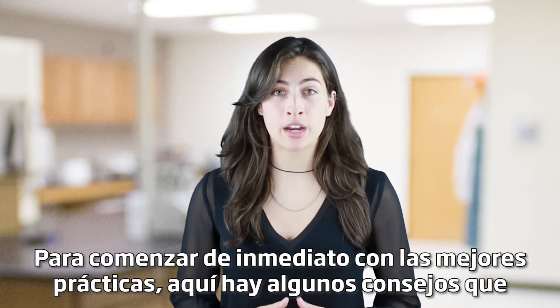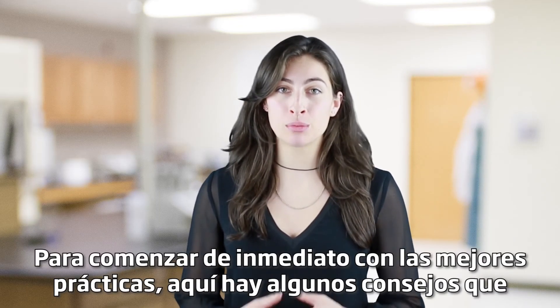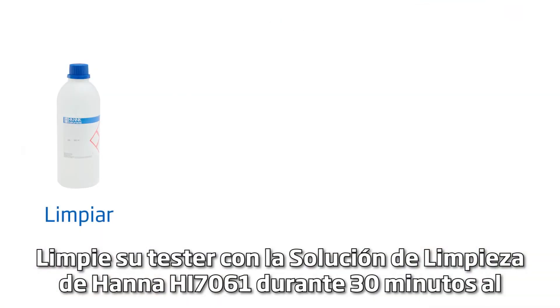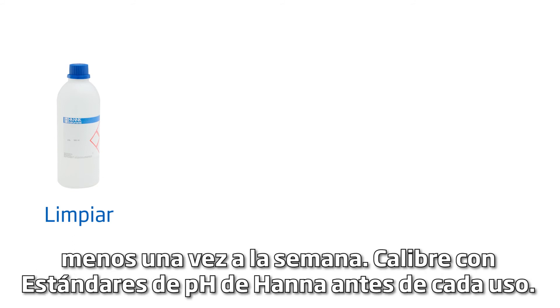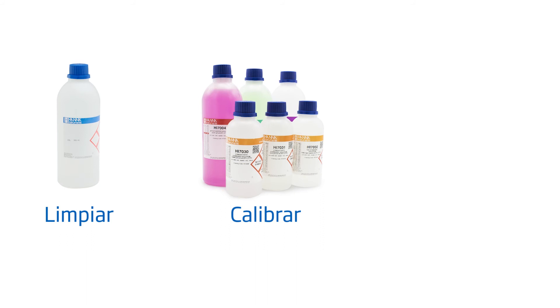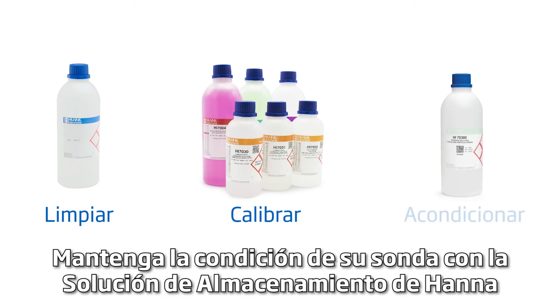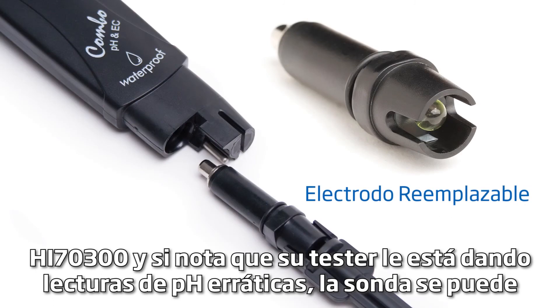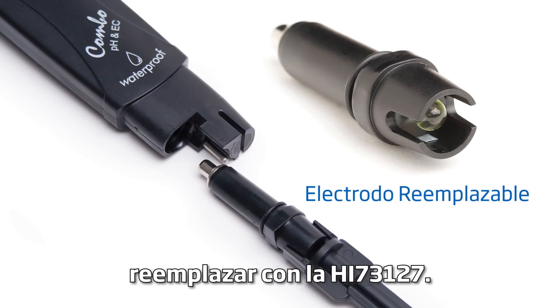To get you started right away with best practices, here are some tips for the best results. Clean your tester with the HANA HI7061 cleaning solution for 30 minutes at least once a week. Calibrate with HANA pH buffers before each use. Keep your probe conditioned with the HANA HI70300 storage solution. And if you notice your tester giving you erratic pH readings, the probe can be replaced with the HI73127.